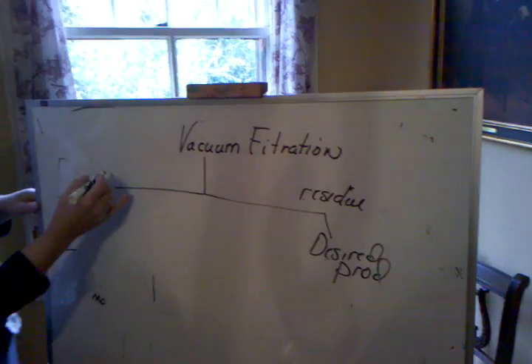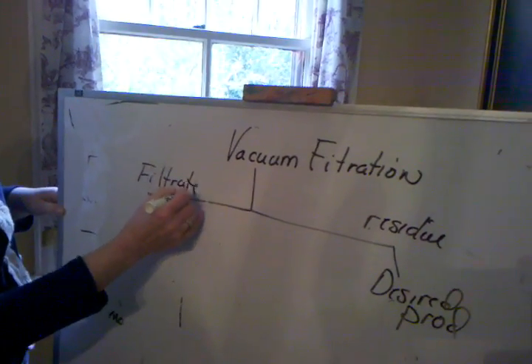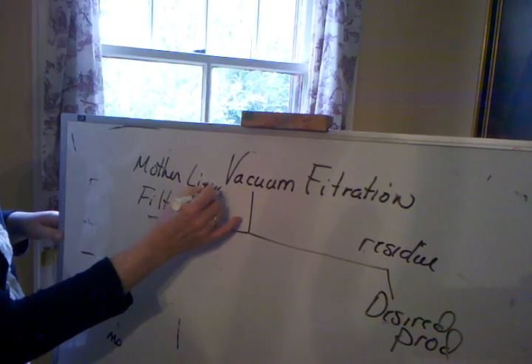Okay? In this case, the filtrate, which I could also call the mother liquor, because it gave birth to the crystals. Okay?